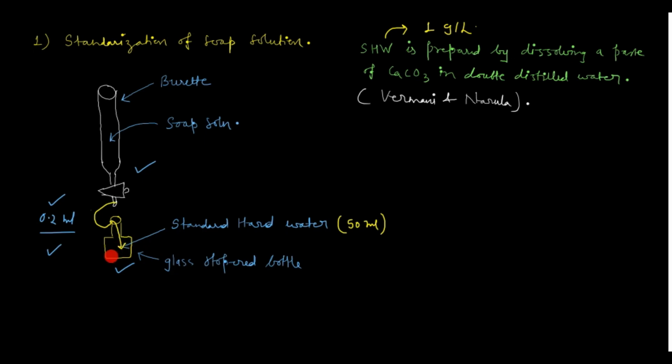That means the reaction has been completed. I will note that volume of soap solution and do the calculation. We will record that volume as V1 ml.